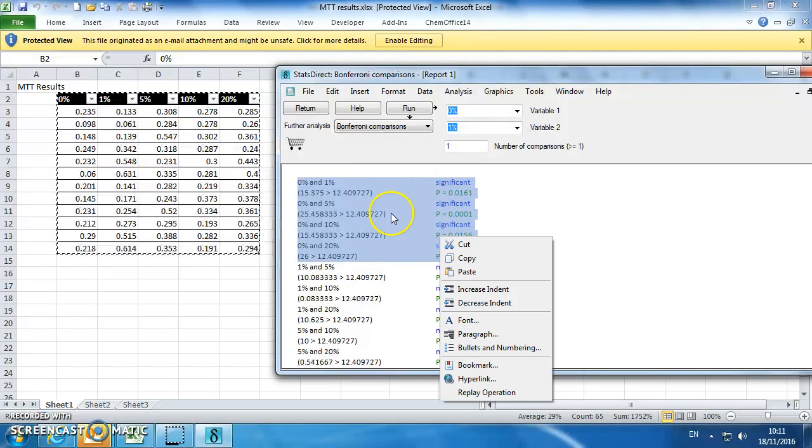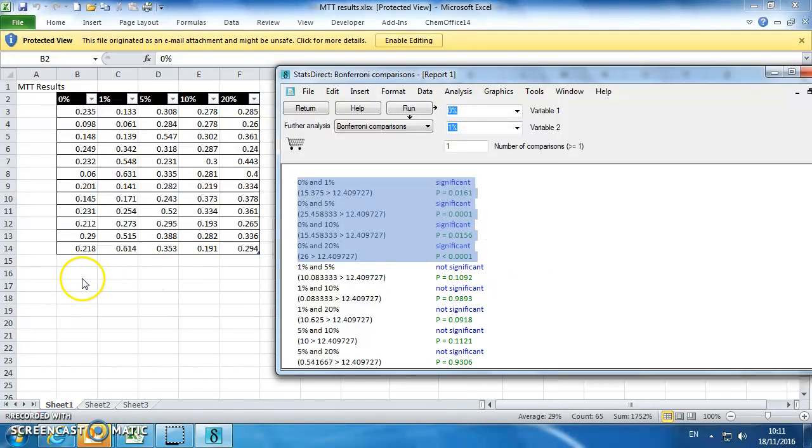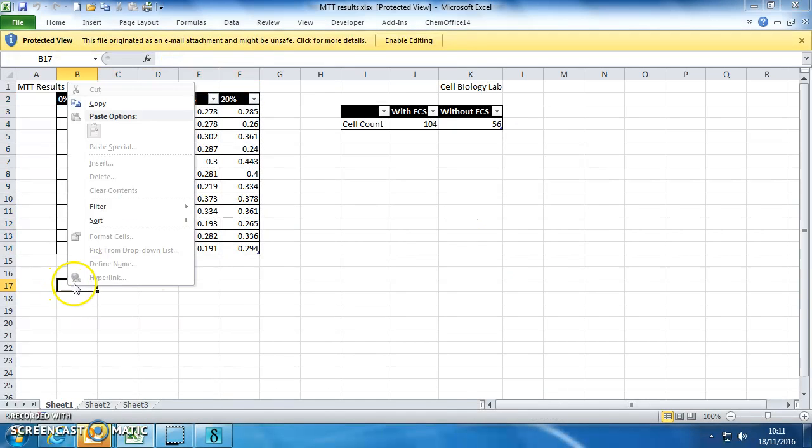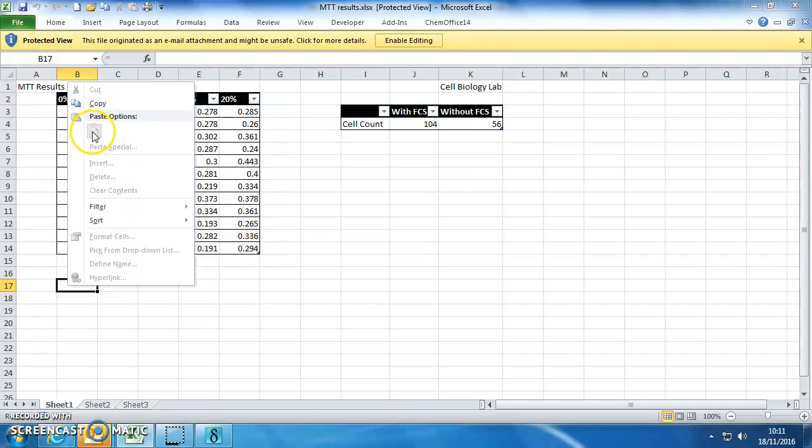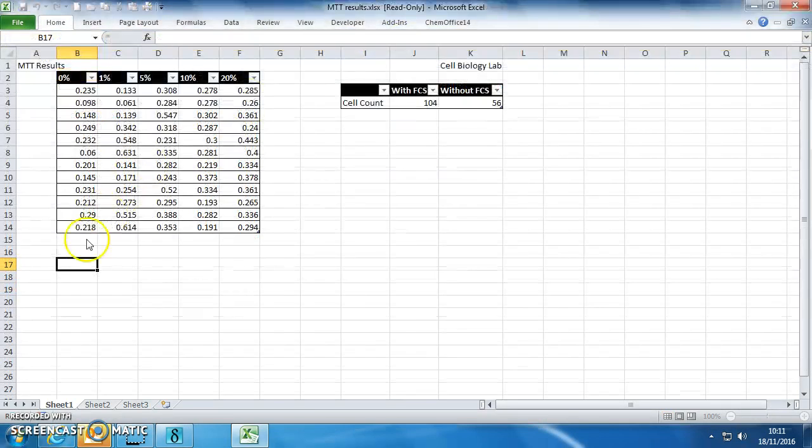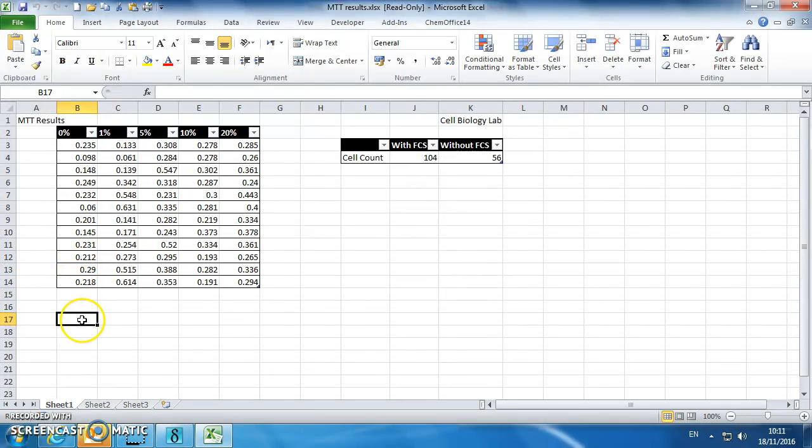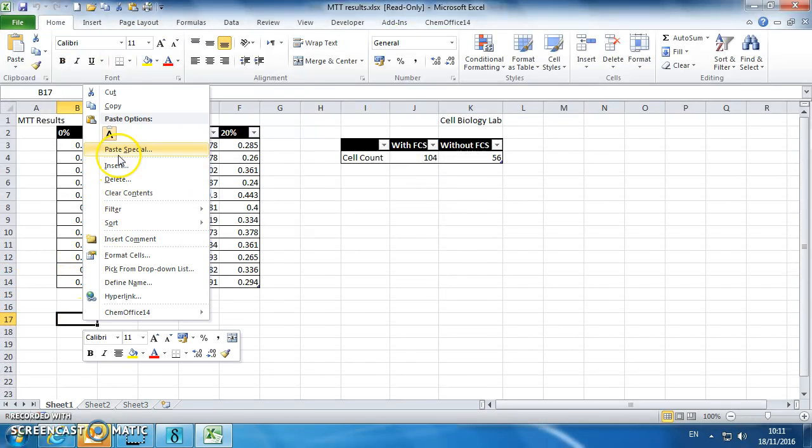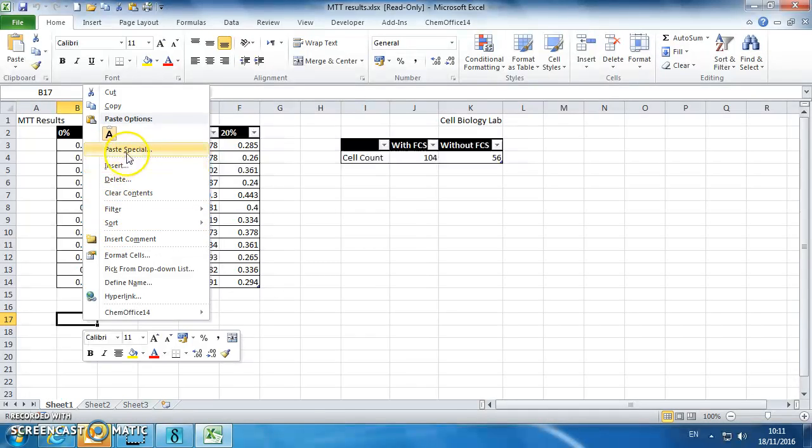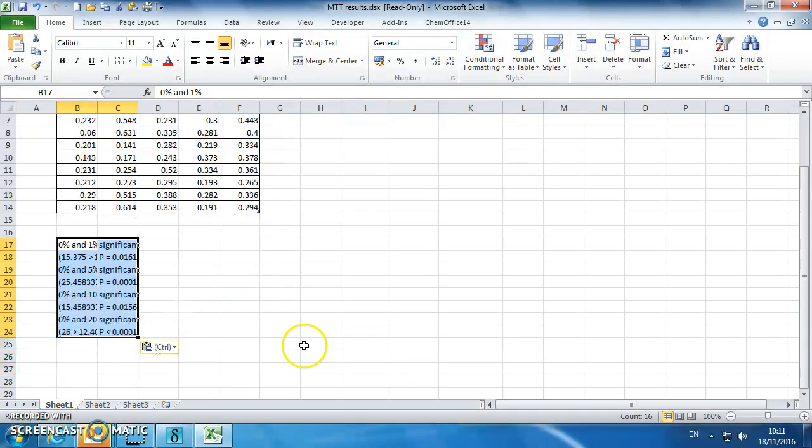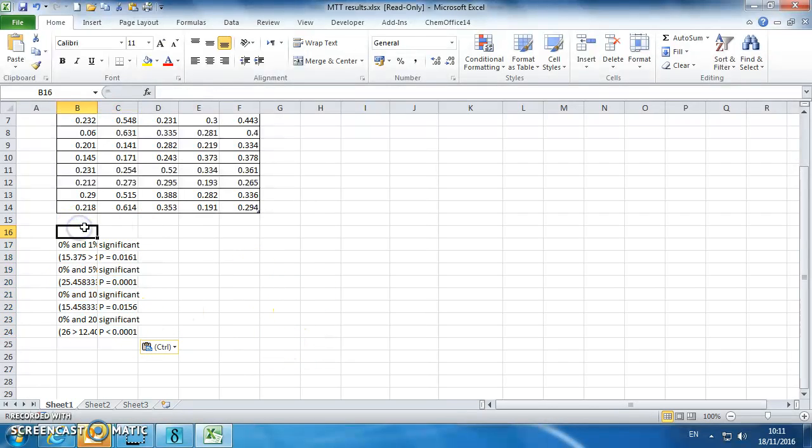You can just copy this text out, paste it into your Excel spreadsheet, and you've just got a permanent record of the ANOVA result.